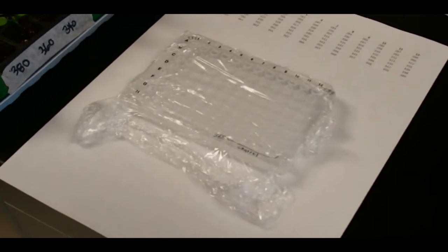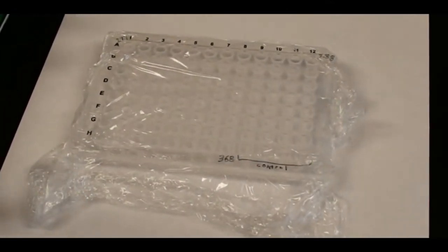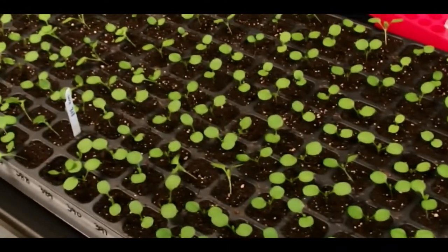In this video, I'm going to show you how to prepare plant samples for high throughput genotyping using the Sigma extract and amp method. I'll show you how to punch plants and get them in an ordered fashion from this flat, which is numbered, into this PCR plate that is also numbered.